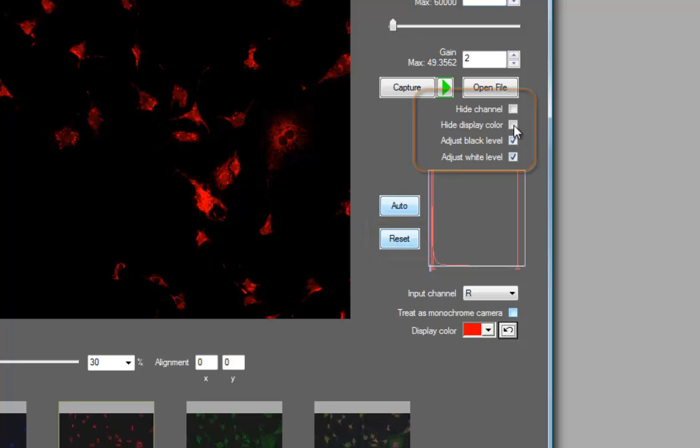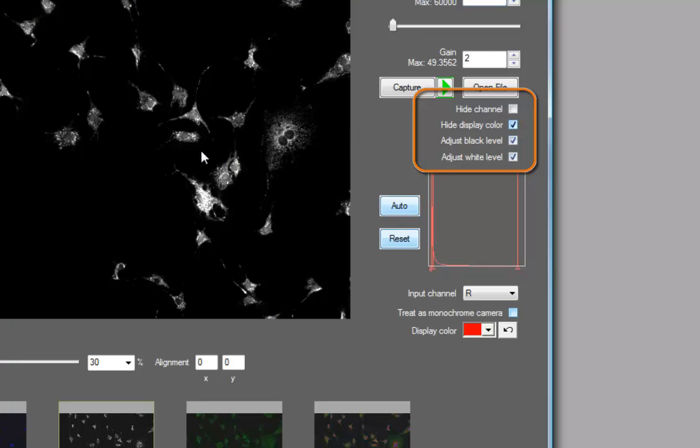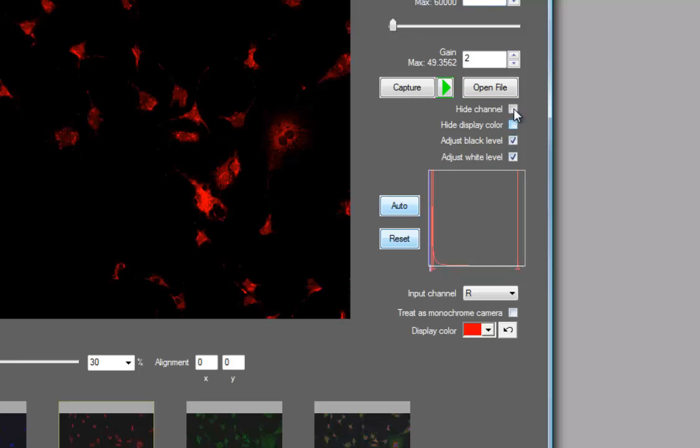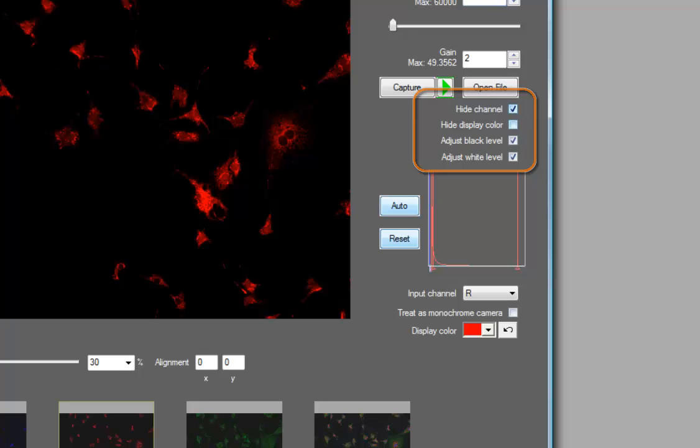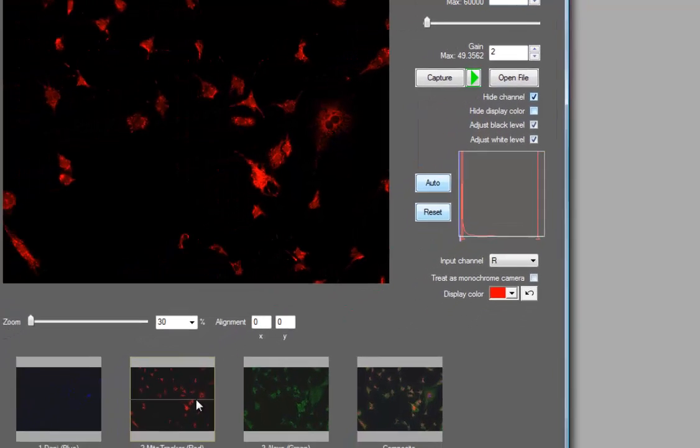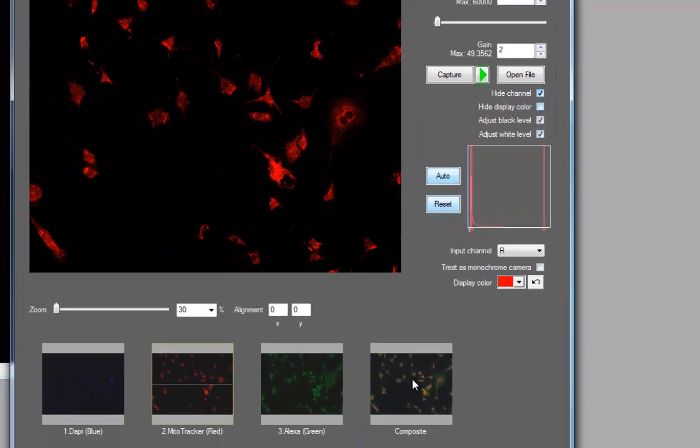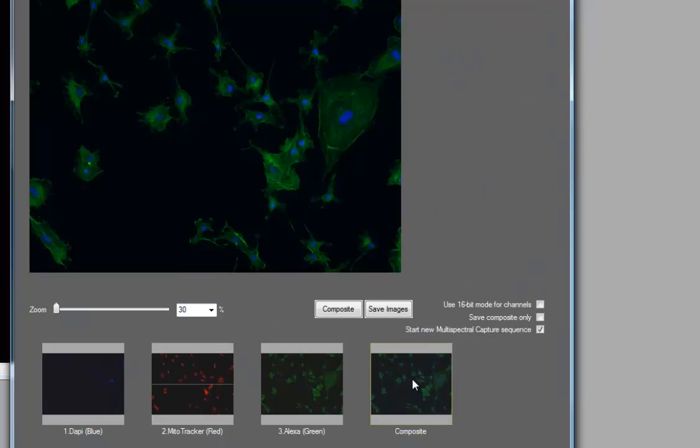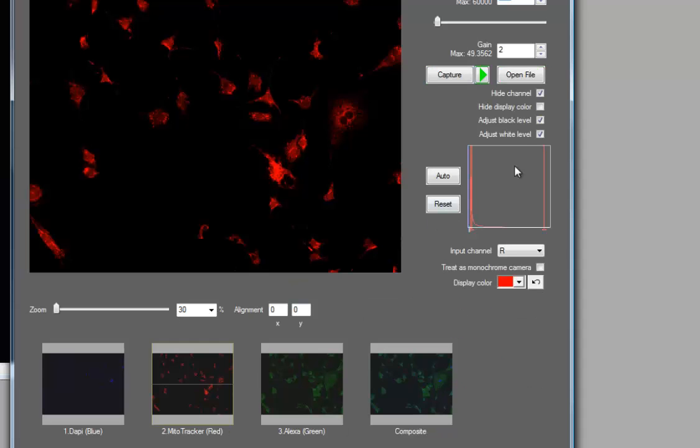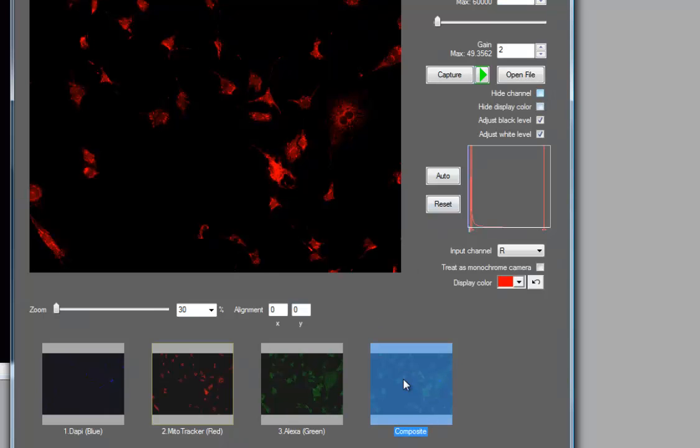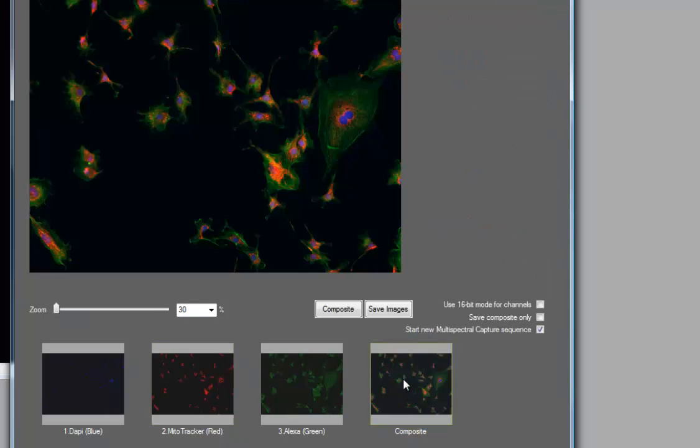You can also hide a display color, meaning it will show you the image without the display color tint applied and show it to you as a monochrome image. If you don't want a particular channel included in the composite, you can simply hide the channel by clicking the mouse button here. What that does is it puts a stroke through the thumbnail and if I now click on the composite, you'll see that my composite has been regenerated with the remaining channels that are not hidden. So in this case, the blue and the green channels. Going back and re-enabling that channel means that it now gets used when I revisit the composite.